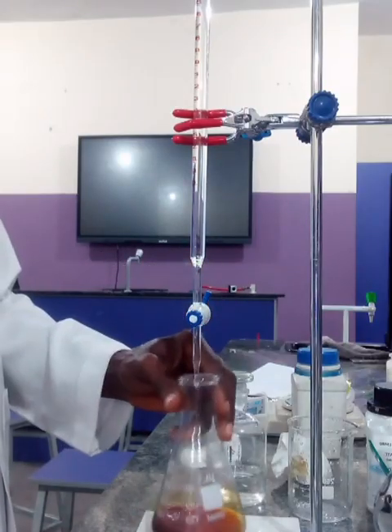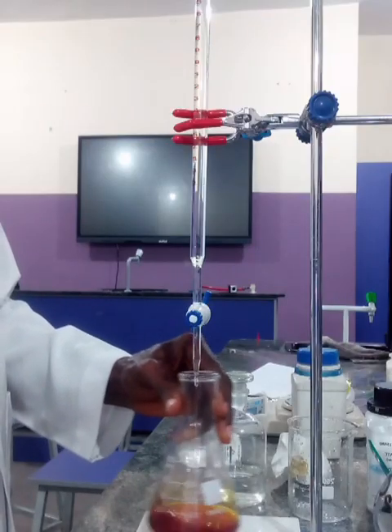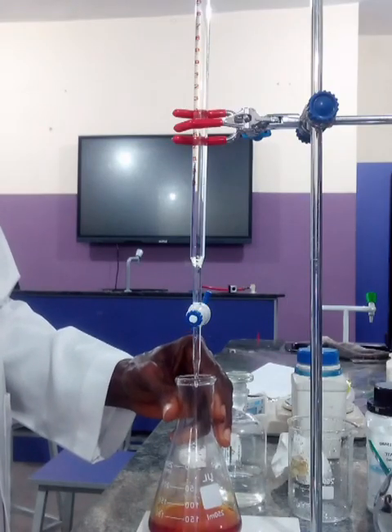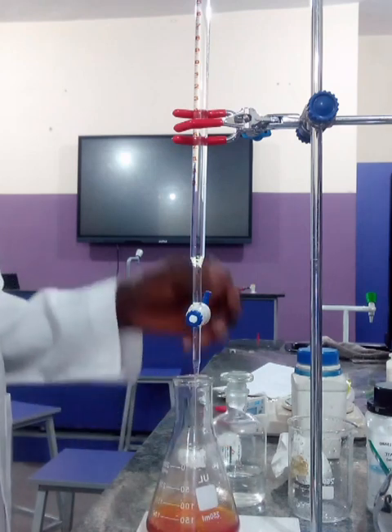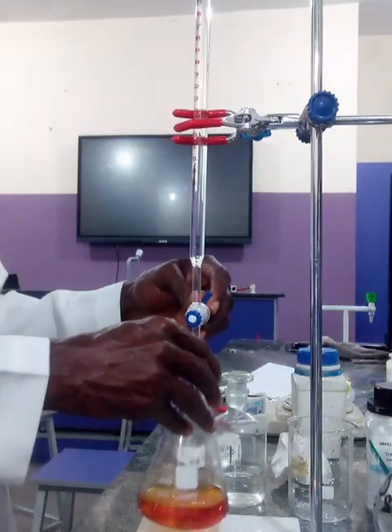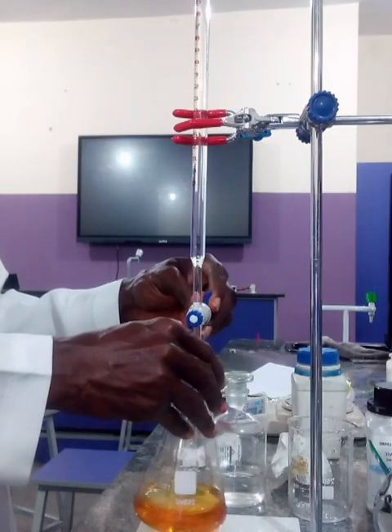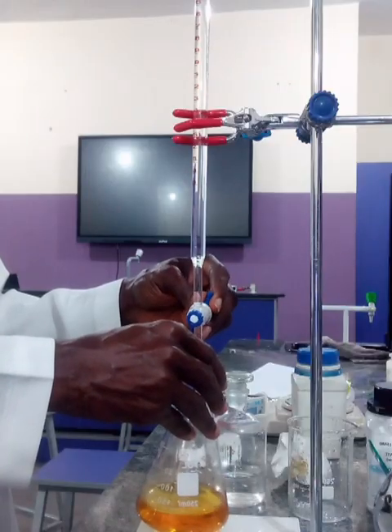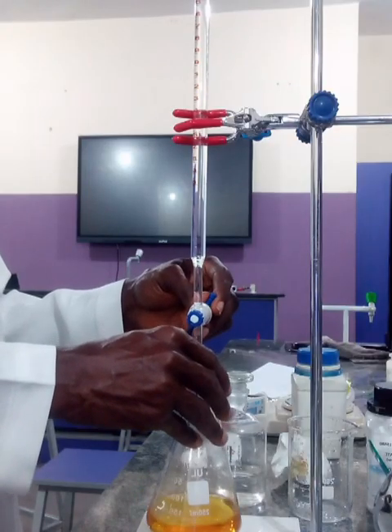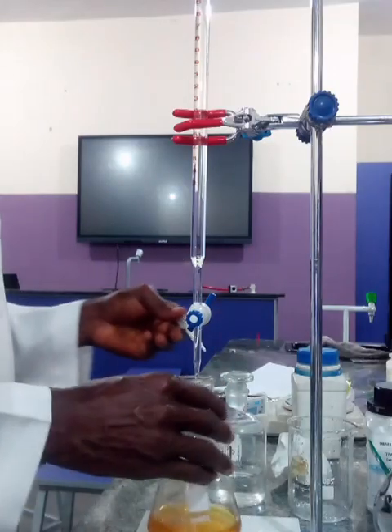After getting an endpoint, you carry out 2 or more accurate titrations and then find your average titer. That's the volume of the sodium thiosulfate that is needed to react with the volume of the iodine in the conical flask.